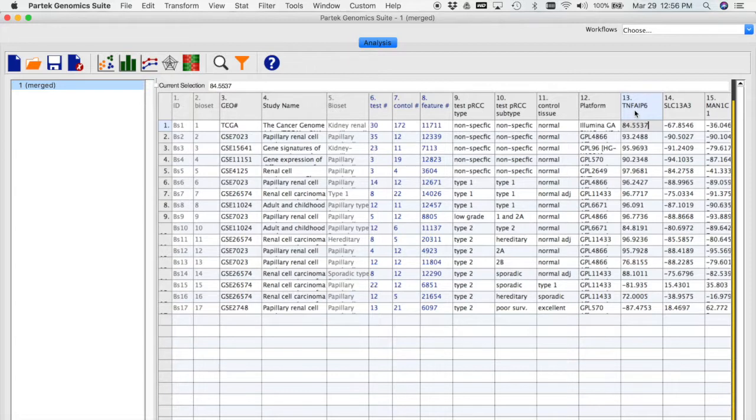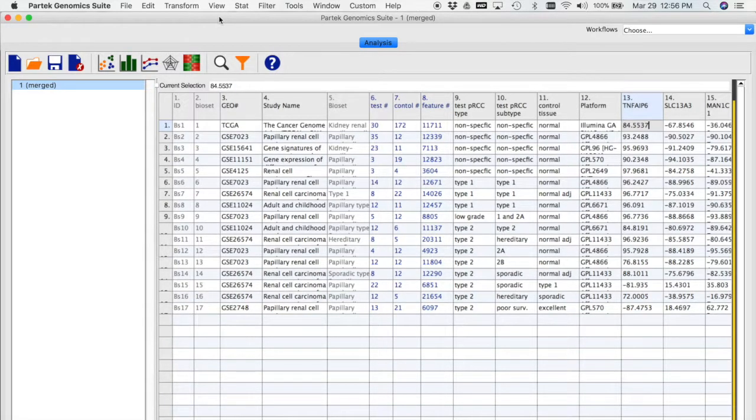And what we're going to do is not bias our data set by taking the majority of things that go up compared to, say, things that go down. So what I'm going to use is our eventual scores, or the sum of these scores, to basically filter our data set into something a little more manageable. So I'm going to show you how to do that right now.